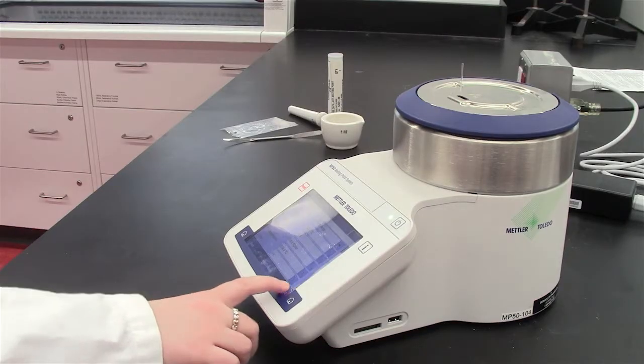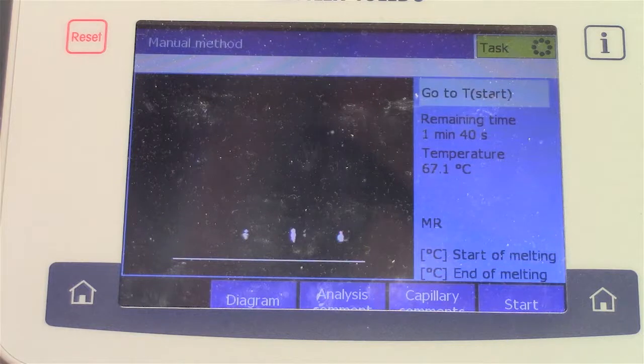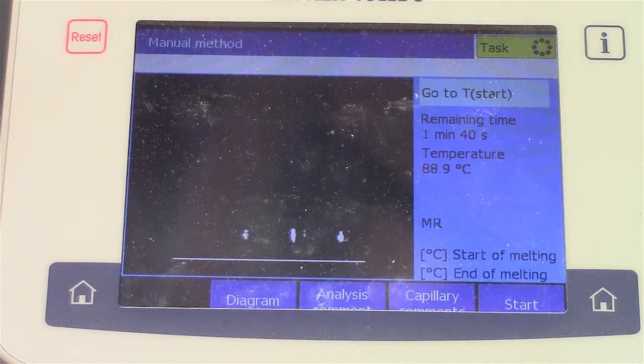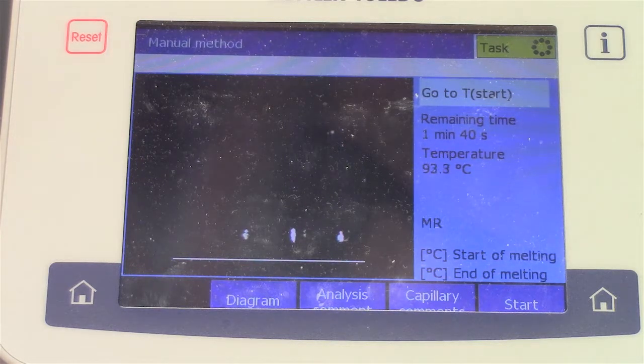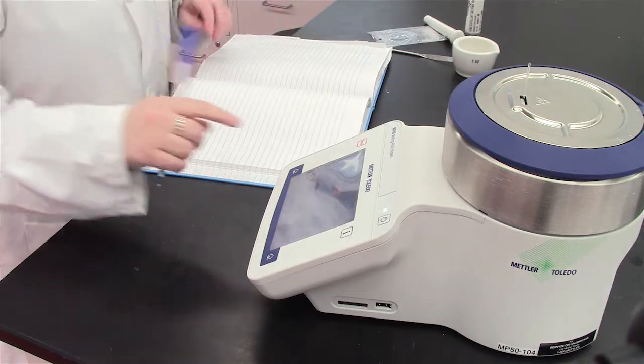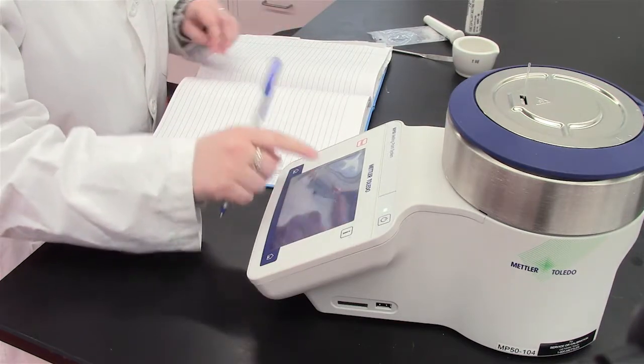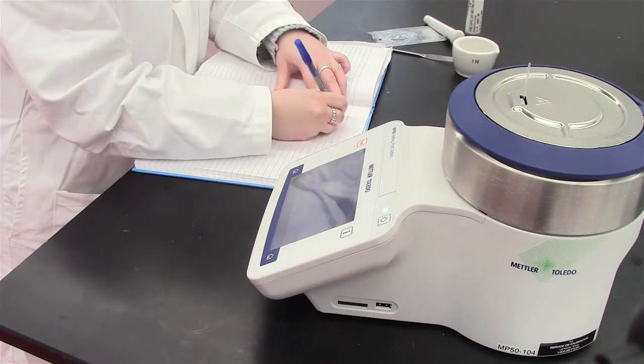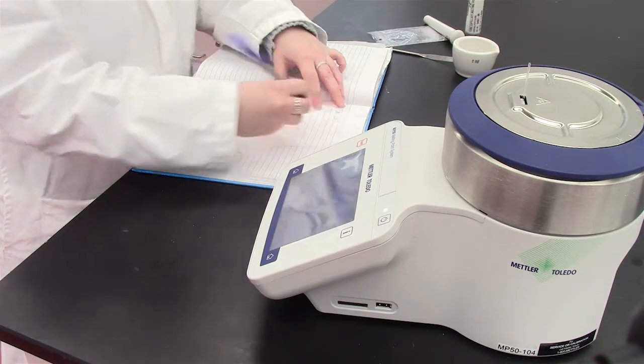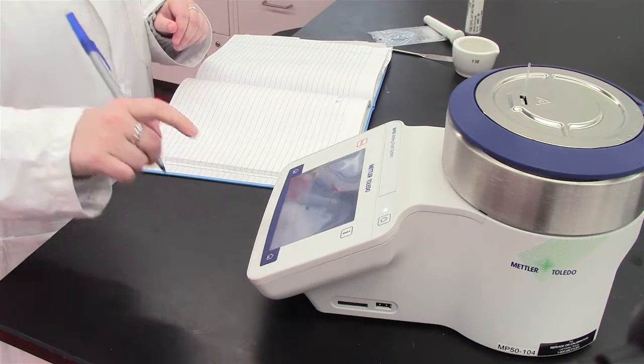Press the start button and wait for the melting point to appear on the screen. You can view your capillary and solid melting on the screen of the machine. Record the melting point of your substance within your notebook and clear the screen by pressing the home button for the next student.